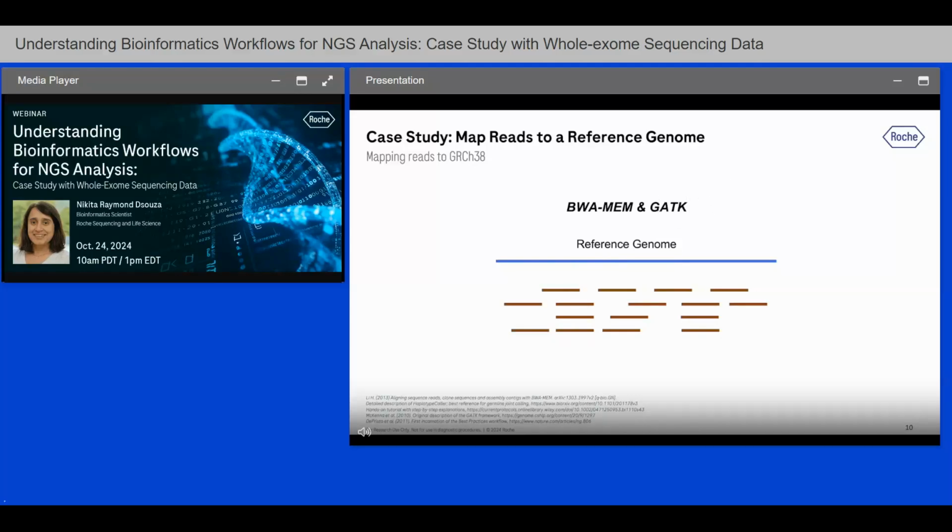So it ensures that two mates of a pair are actually in the file since we are working with paired-end reads. So sometimes prior filtering may remove one mate of a pair. And here I'm showing an example of one FASTQ file that's mapped to the reference genome, but it's also going to have its other paired-end read, where maybe that mate might not exist.